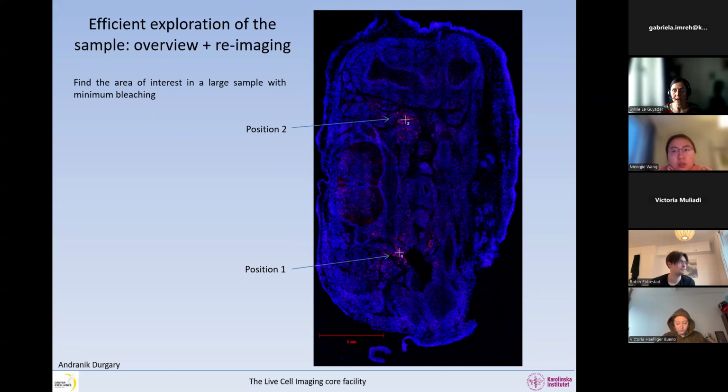And clearly, if you use a single point confocal, this is going to be slow, but we don't have to be slow because we are going to see this next week. You can use very big pixels. You use a low magnification objective, you get big pixels, you get the full field of view, and you image with the maximum speed, no averaging, whatever. You can go very fast as well and image the whole thing.